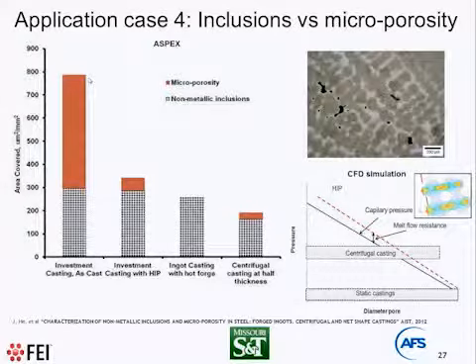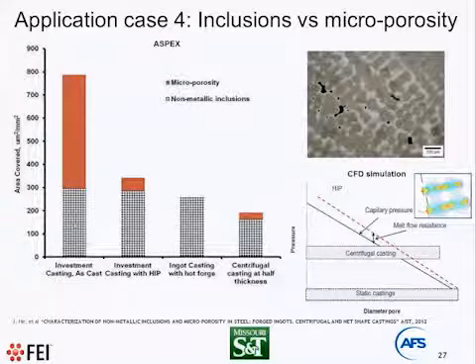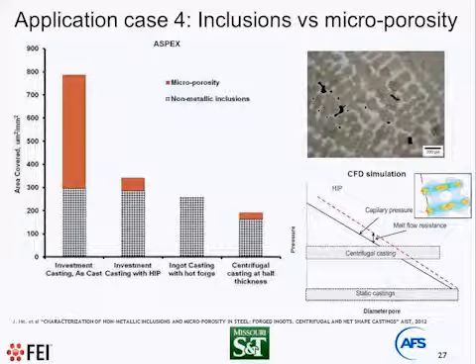When you see investment casting, you see approximately 50-50 number of micropores versus inclusions. From fracture mechanics, they have a practically similar effect in degrading properties. When we apply the HIP process to this casting, of course we did not change inclusions, but we significantly decreased porosity in the casting. It is also interesting to mention that this type of microporosity cannot be completely removed even during the HIP process.